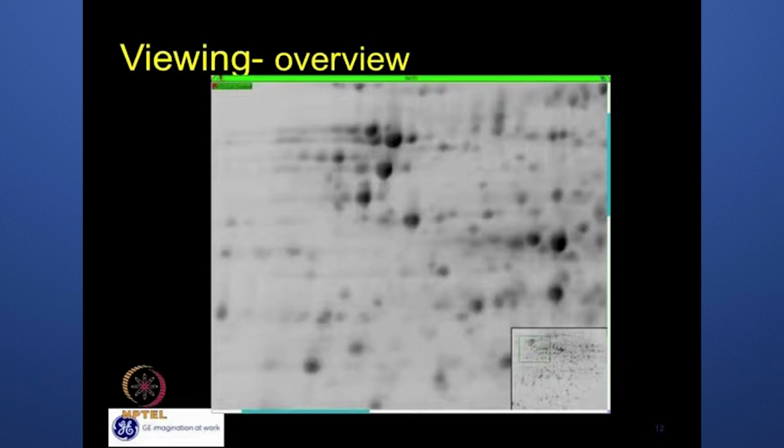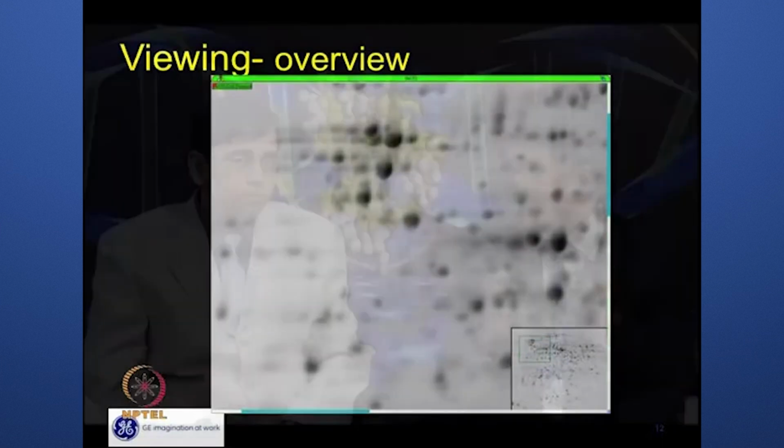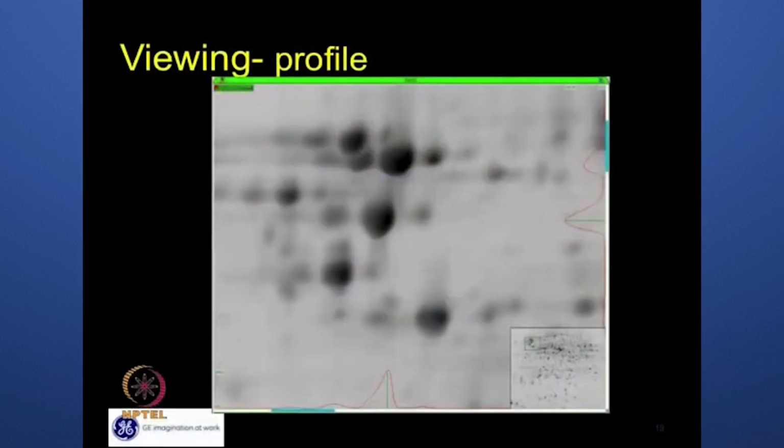You can decide actually here, especially when one manually draws the outline while zooming into that particular image. So this is a very helpful tool. Yeah, many times when you have many gels and you just want to look at one particular area, it's not really possible to look at a very small image, so you need zoom tools for expanding the image.